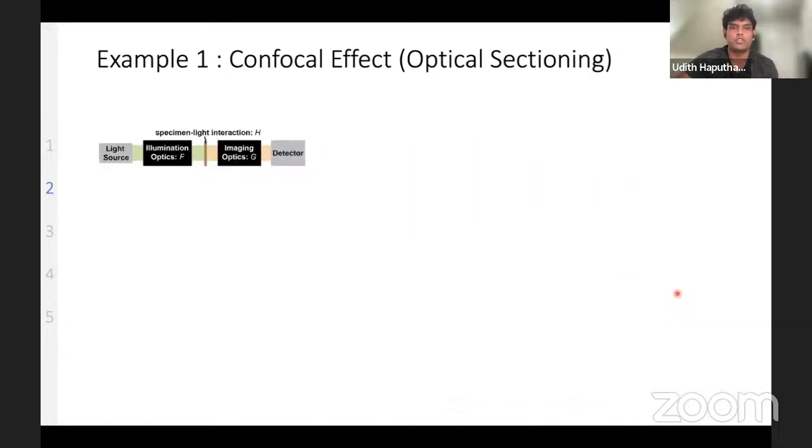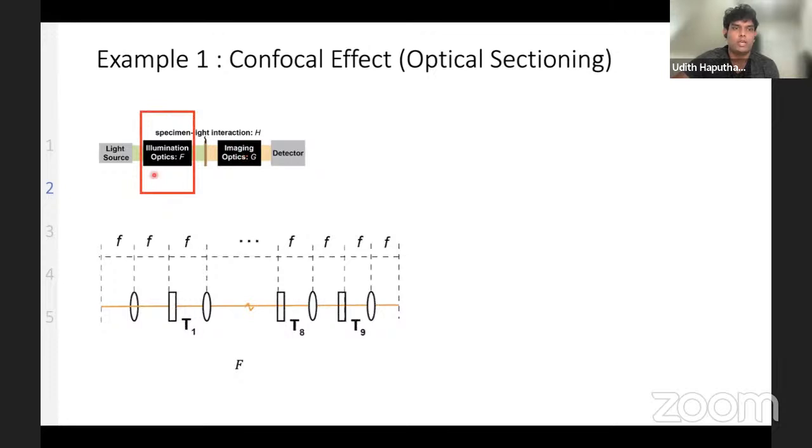So we have our general optical setup, and we use our proposed overparameterization model to model the illumination optics and also the imaging optics.